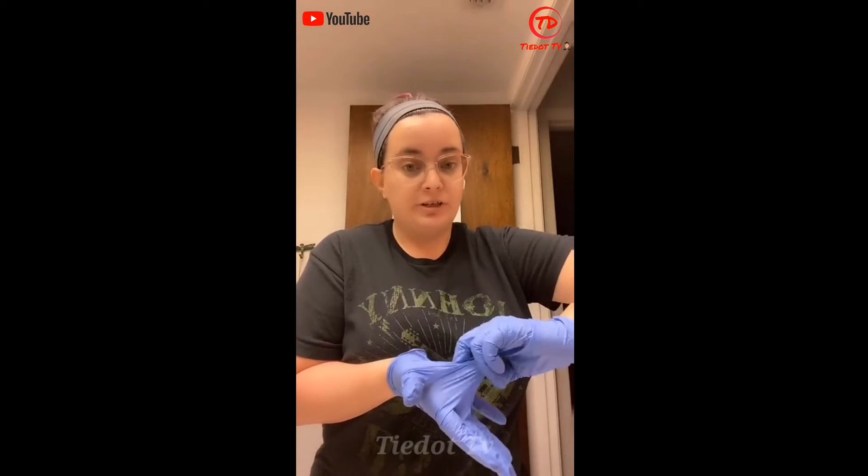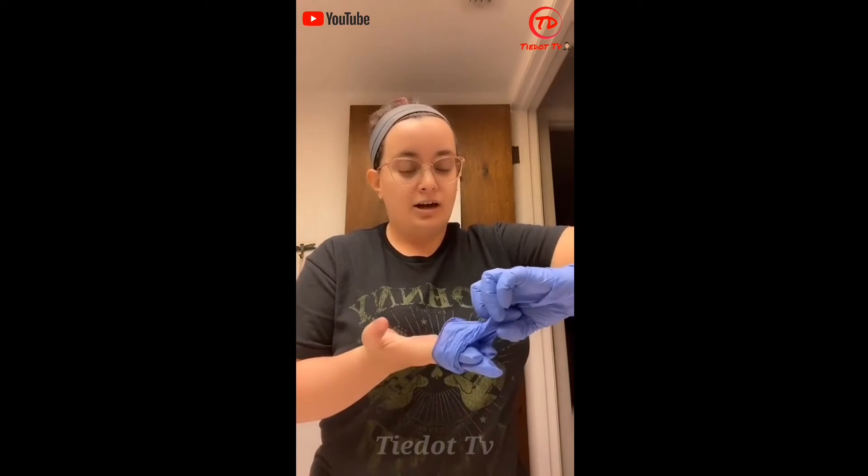So when you take them off, instead of grabbing them at the fingers, you're going to want to grab the palm of one hand and kind of walk it off with your fingers. It's really important not to touch your wrist while you're doing this — you want to keep dirty on dirty. As you're walking it off, grab it with the other hand.